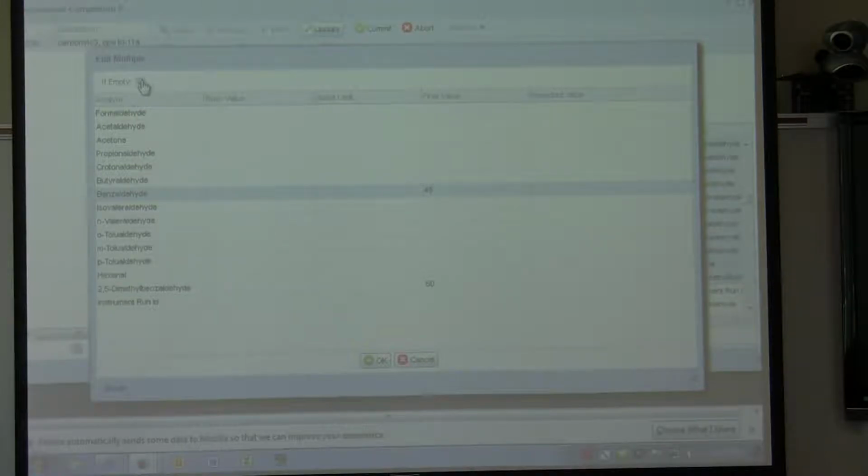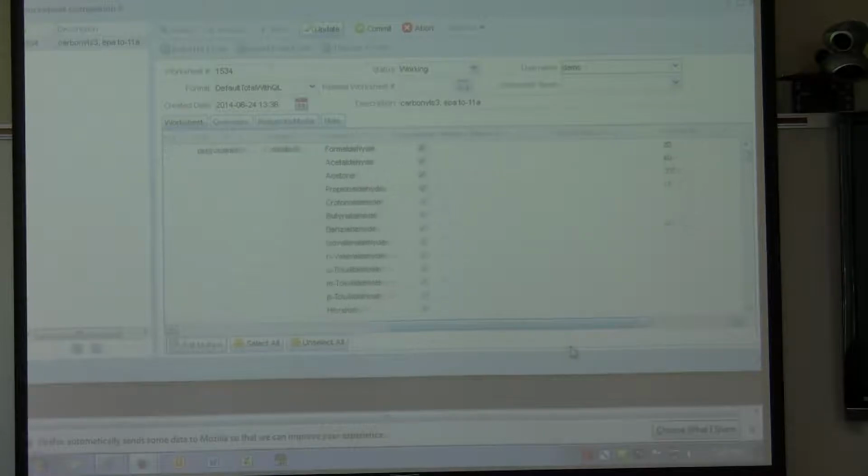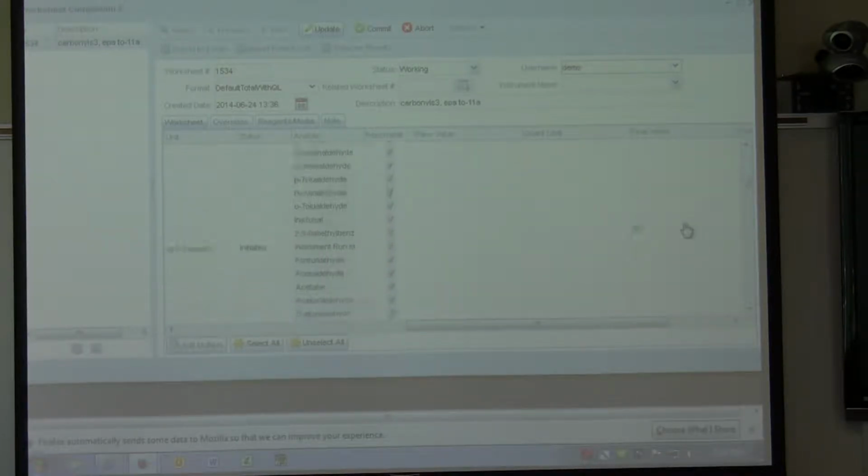If you uncheck the field, no matter what value is there, it's going to put 45 in. So I will leave this checked because I don't want to override any of the existing ones. I will click OK. So we'll refresh a bit, and you'll see 45 is under there, 60, 45, 60, all those samples I had selected. It fills in the final value that I picked.